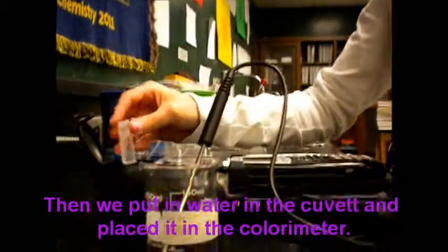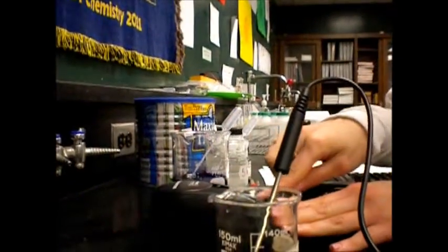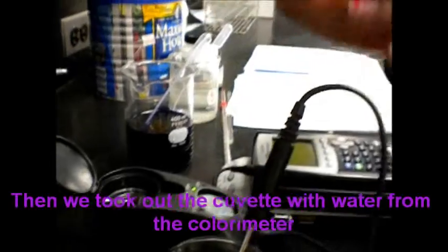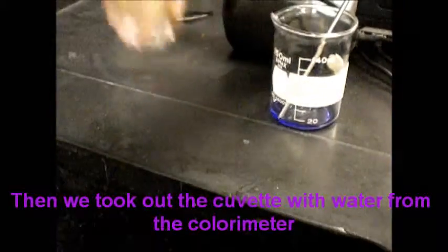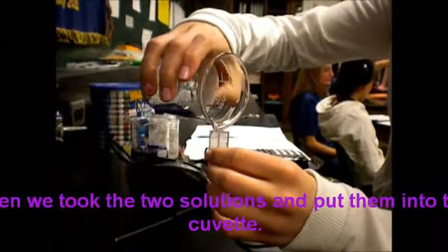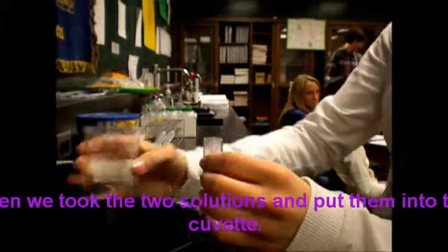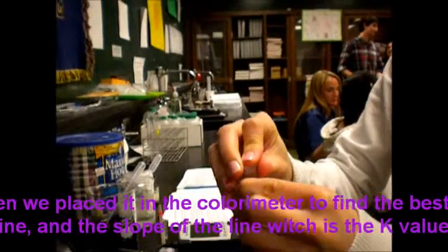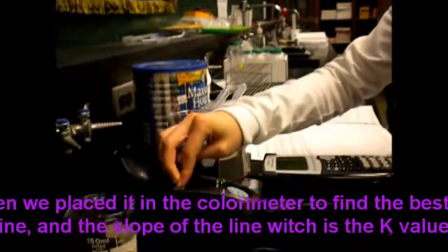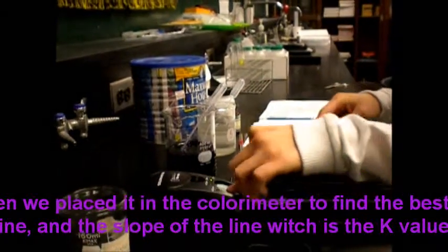Then we put the water in the cuvette and placed it in the colorimeter. Then we took the cuvette with the water from the colorimeter. Then we took the 2 solutions and put them into the cuvette. Then we placed it into the colorimeter to find the best fit line and the slope of the line, which is the K value.